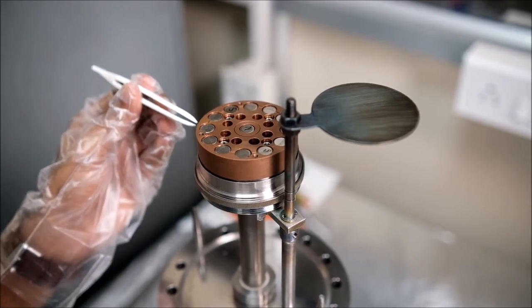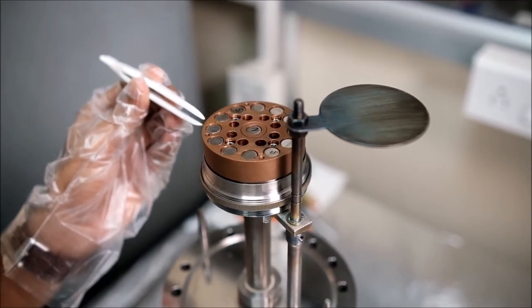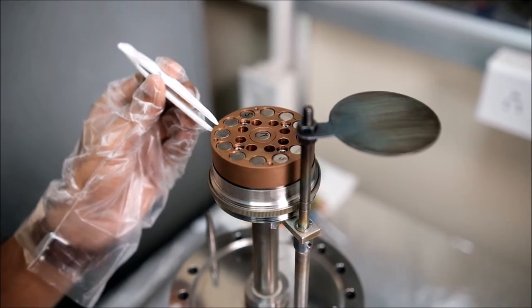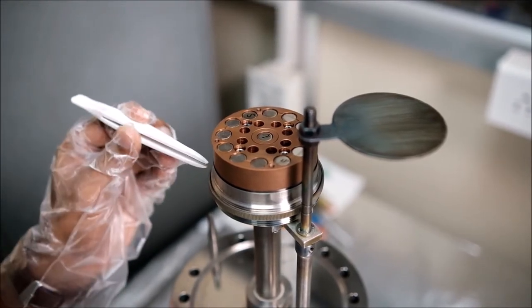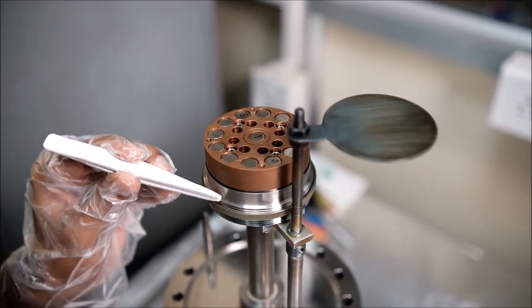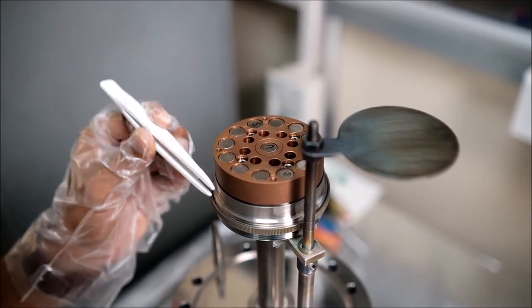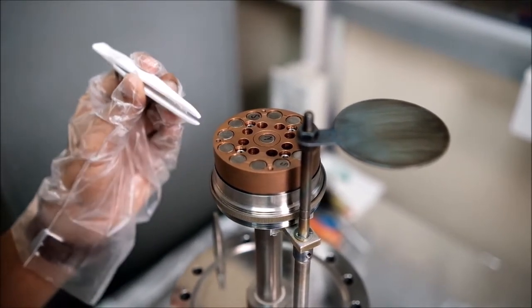This is the inside part of the gun. I have kept it open and will attach parts one by one so you understand how the power system is connected. This is where the power comes — the DC or RF source power. It is attached to this power unit, and this part is the ground unit. These two have to be separated so that they don't get shorted.